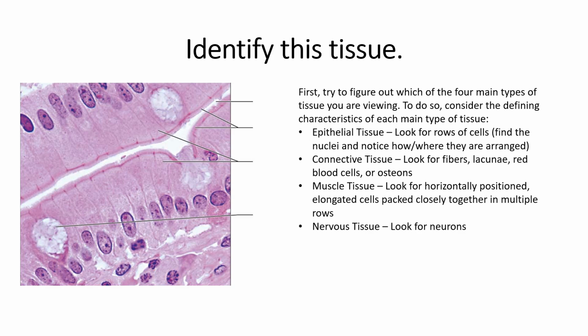We see a row of column-shaped cells or rectangular-shaped cells, and then we have space, so the lumen, before we get to the other side of this organ. All right? So muscle tissue, I don't think it's muscle tissue. Also, notice that where you have this distinctive row of cells, once we get below that, we run into connective tissue, right? So muscle tissue, we can count that out. So then we're thinking, is it one of the types of connective tissues or is it epithelial?